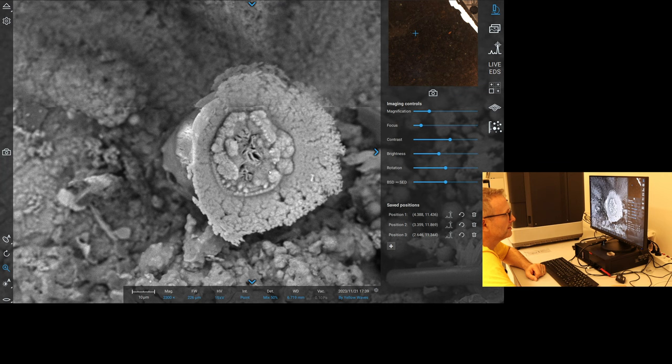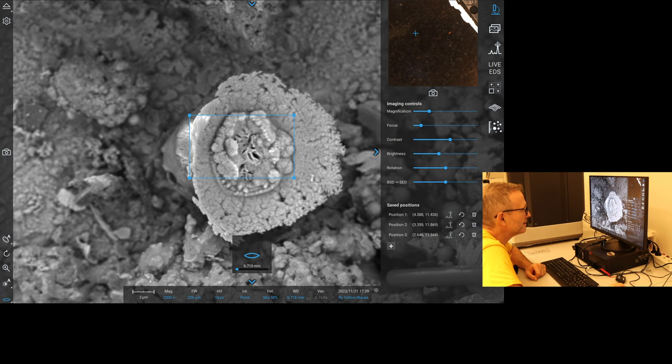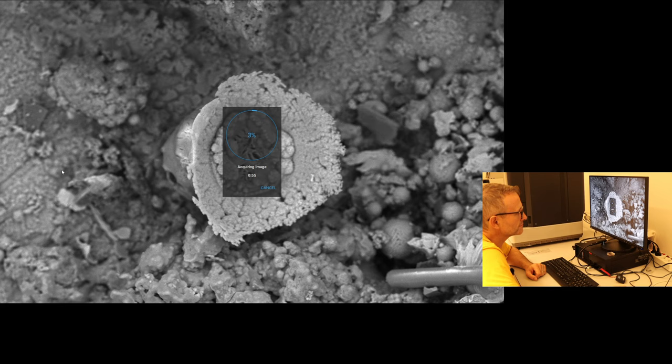Well, that's rather nice, isn't it? Whatever it is. I'm not entirely sure what it is, but it's quite pretty. Iron-rich crenellated sphere, crenellated sphere, crenellated sphere. When they have the other elements in there, they don't form these beautiful iron oxide crystals that are kind of like a little bit mutilated.